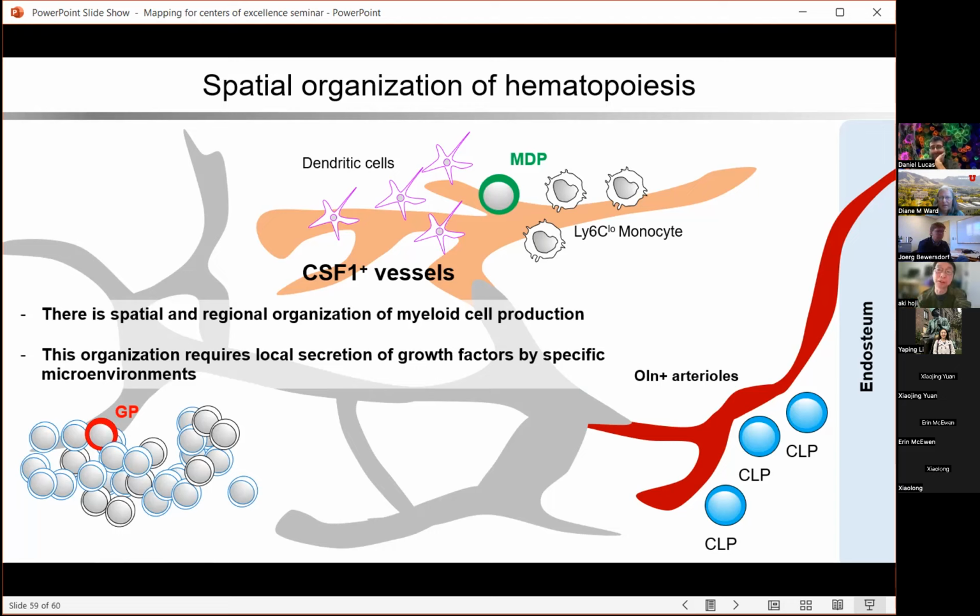Have you done an intranuclear staining? I'm looking for GATA2, that sort of staining. Is it possible to do this? So it's certainly possible. It depends on which type of cells. To do a nuclear stain, you're going to have to use a harsher fixation and permeabilization, so you need to make sure that the markers you use to identify your cells are going to survive that treatment.